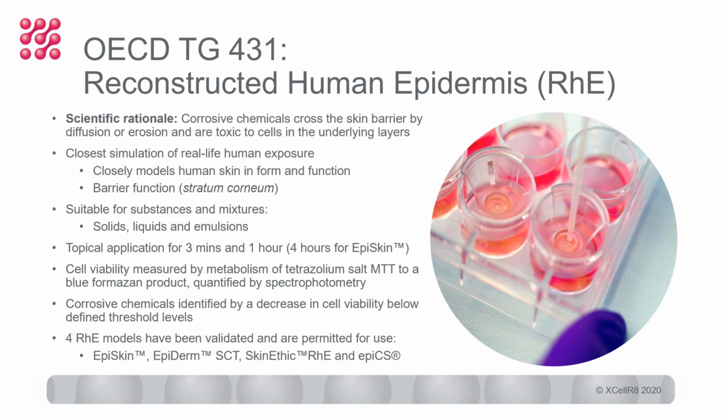You'll also see that there's a 4-hour additional time point for the EpiSkin method, which is used to subcategorize chemicals, and I'll go on to talk about that in detail in a moment.